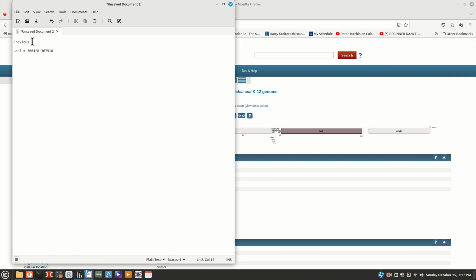367587. Make sure you type in the right one, 367587. And that one goes to, now notice that it's going in the same direction, and that's good for us, 368420. Alright, so where is this? And this one ends at 367510.